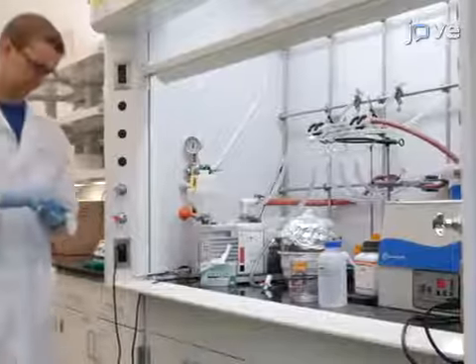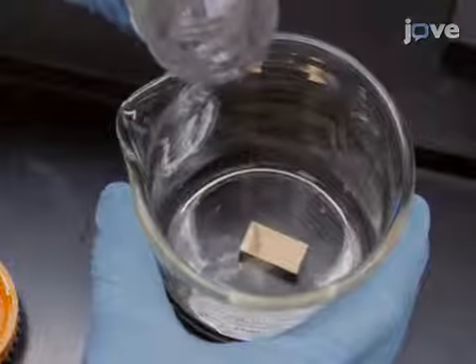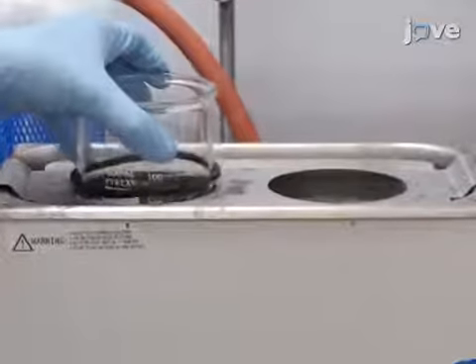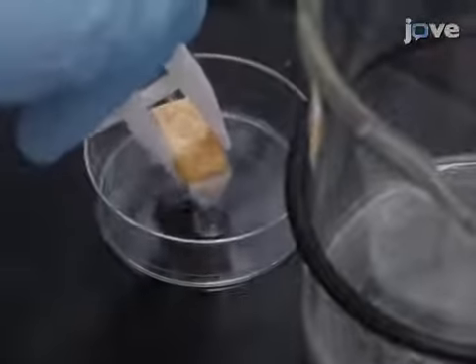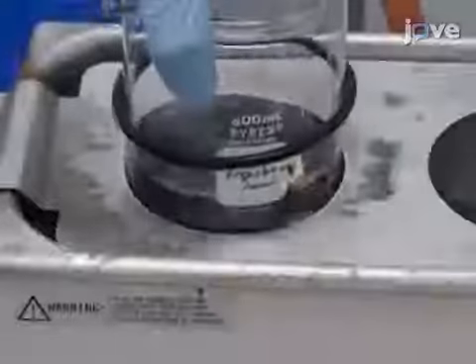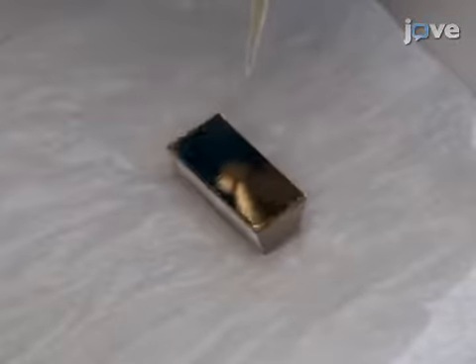After preparing solutions and protein samples according to the protocol, use 120 milliliters of stabilized Piranha solution to clean the gold chip by sonication at 50 degrees Celsius for 90 minutes. Use water to rinse the chip and sonicate in water for 5 minutes. Then rinse the chip with ethanol and use a nitrogen stream to dry it.